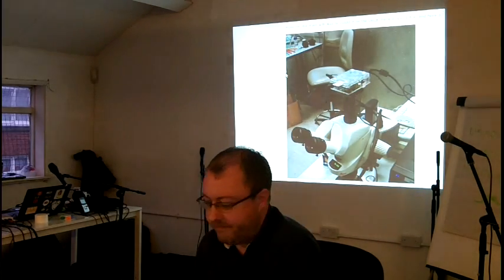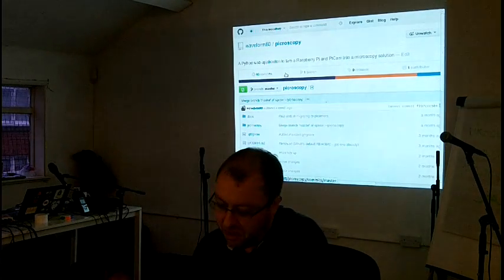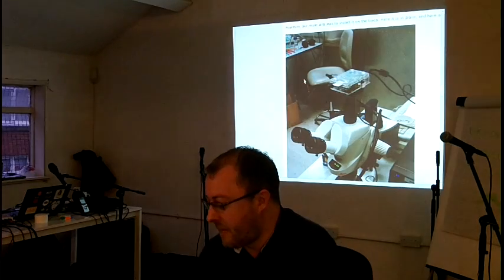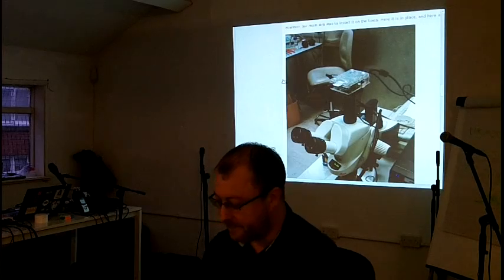So the question was, can we do this? I sat down and wrote a little thing called Picroscopy, initially with raspistill and raspivid. It worked tolerably well, but this is what eventually led to the development of the PiCamera library. Meanwhile, a guy called Dave Cox down at the University of Surrey has been doing something similar. He's been attacking it from the other end, going, I don't know much about software, but I can probably do the hardware bit. He's come up with a really neat way of mounting a Raspberry Pi on top of a microscope, as you can see here. Hopefully he's going to send me the design for that. We've been corresponding over email, and when the University of Manchester gets their 3D printer sorted, we'll be able to make one of these. But in the meantime, I'll have a look at the software and how we build such a thing.